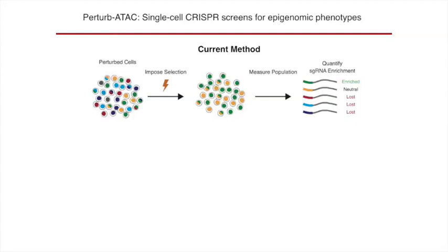So we're just doing high multi-dimensional analysis of many, many parameters. Doesn't really matter if it's CRISPR guides or antibodies, right? The logic is the same. So the standard way to do a CRISPR screen is to take a pool of cells, put in a pool of CRISPR guides, and then impose some selection, either cell growth or cell death, something like that, or maybe the expression of a single marker, and then look at what comes out of that pool. Are our guides depleted or enriched to associate them with that particular selection that you put in?